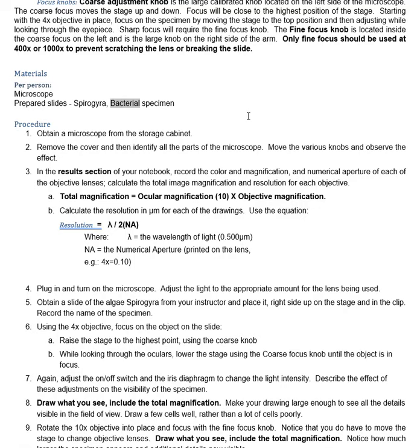So once you've got it perfectly adjusted, centered, and you've got the sharpest picture possible, then you go on the nose piece and you rotate it from the 4X to the 10X, and you do the same thing. You can use the coarse adjustment. A lot of times you won't need it, but you'll use the fine focus to regain that sharp, clear image. You're going to make sure that you've got it totally centered in your little white circle of light. Now at this point, you can actually try changing the light on that little dimmer wheel, because you are going to have to change it as you go up. You're actually going to need more light as you go up, but you've got to be careful.